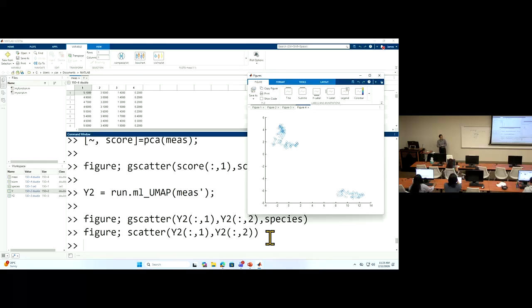All right, if you have no question, we are going to move to the interface and use real data to see how this dimensionality reduction applies to single cell data.